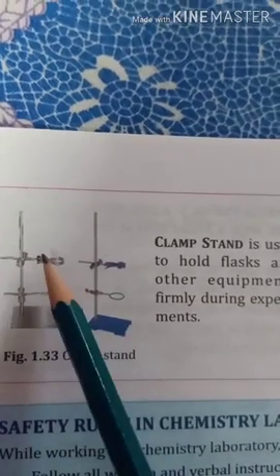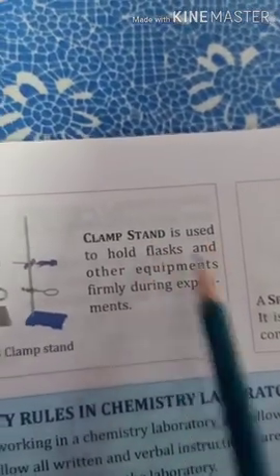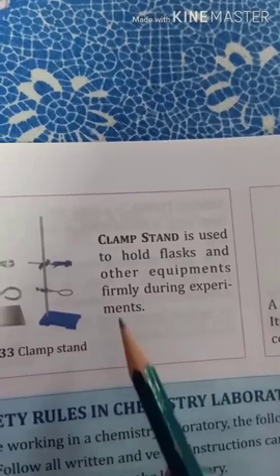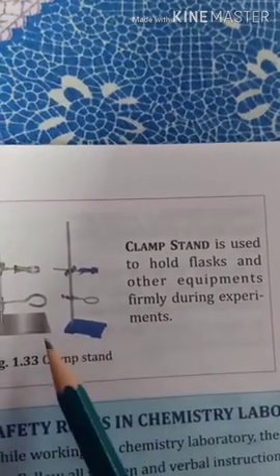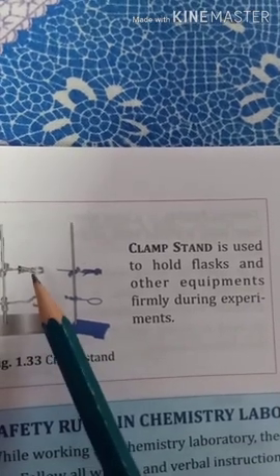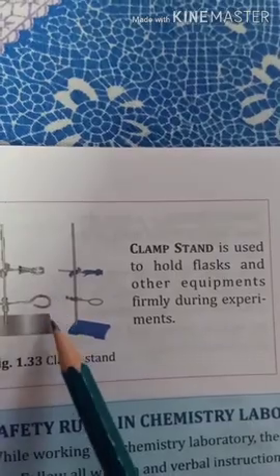These are the clamp stands, and clamp stands are used to hold flasks and other equipment firmly during experiments. So during experiments we hold different apparatus in these clamp stands.